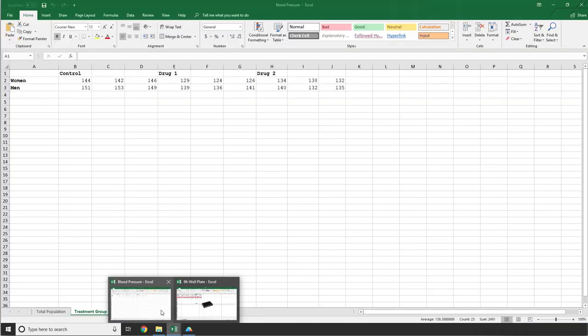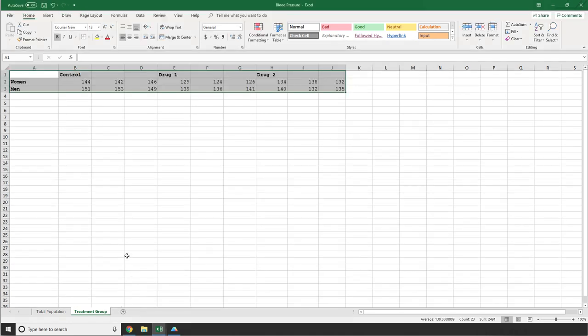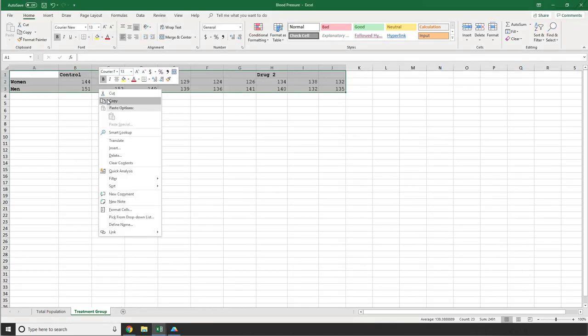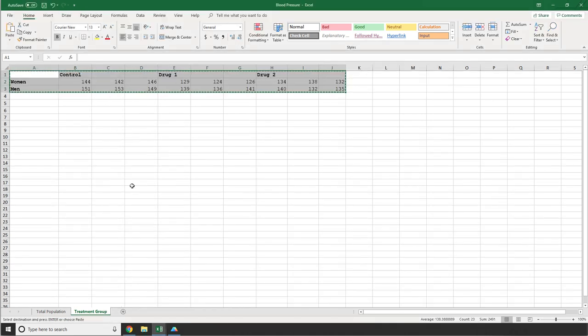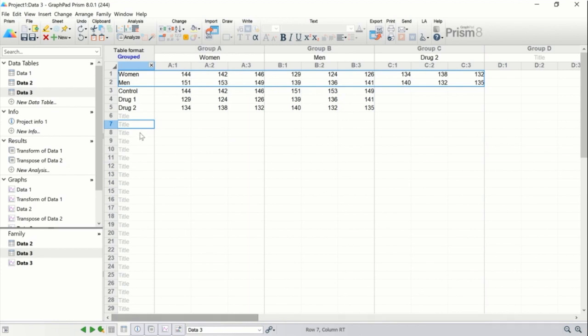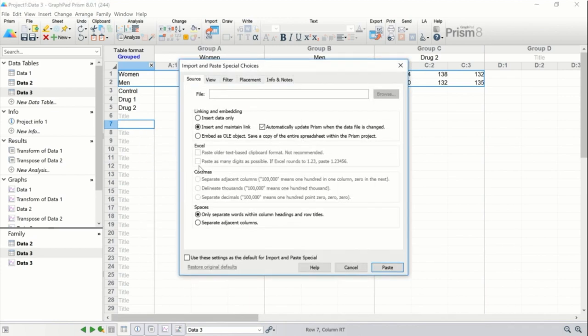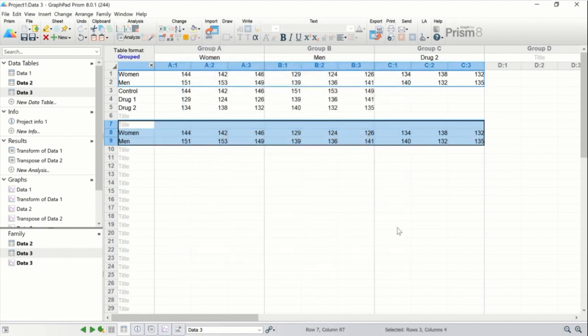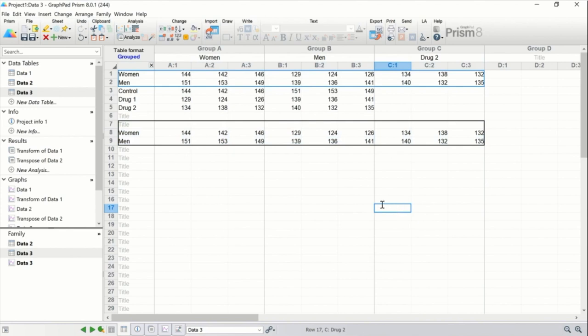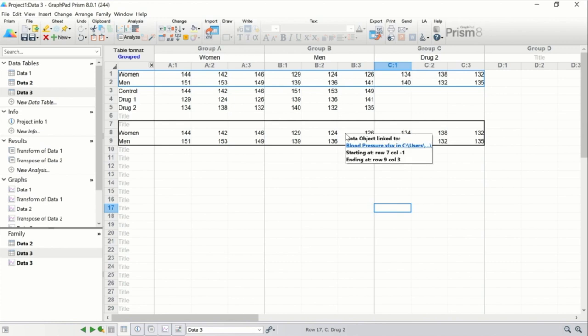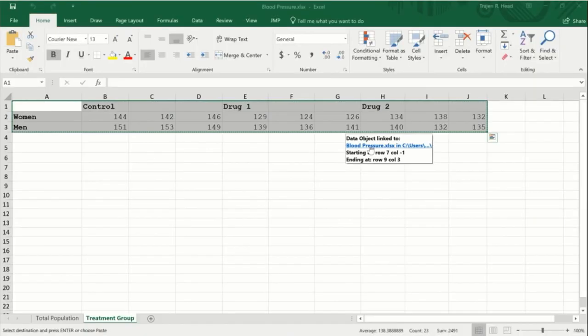So let's cancel this dialog and go back to our blood pressure Excel file. If I copy this data, we can go back into Prism and either simply choose paste link by right clicking within a cell or I can select paste special. This again brings up the import and paste special dialog. Let's choose insert and maintain link and click paste. You'll notice that because the source data came from outside Prism, the box bounding the data is black. And if we hover over the data, we can click a link that will take us to the original Excel document.